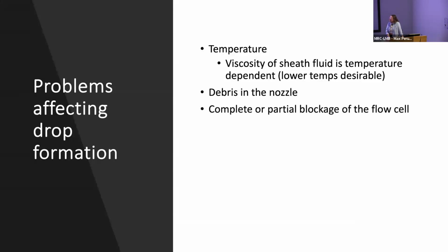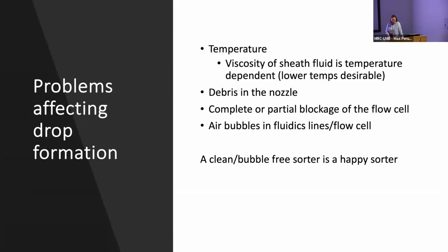Also a complete or partial blockage of the flow cell, and any air bubbles in the fluidics lines or in the flow cell, which I touched upon earlier. So basically a clean and bubble-free sorter is a happy sorter. Hence why we take our time in the morning to set everything up to ensure that we have very smooth sorts throughout the day.